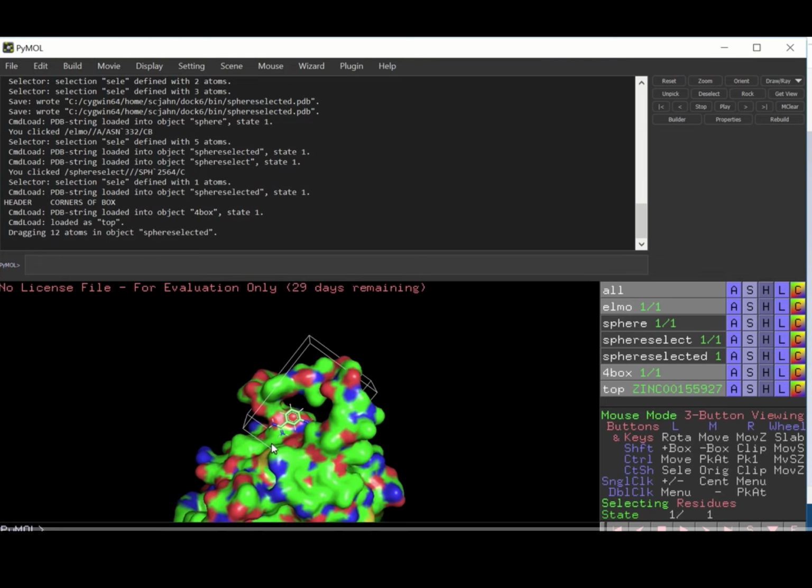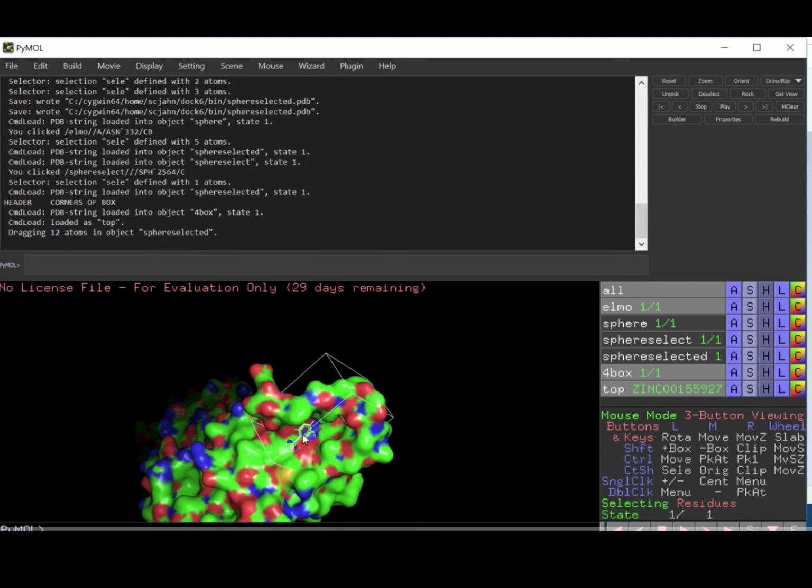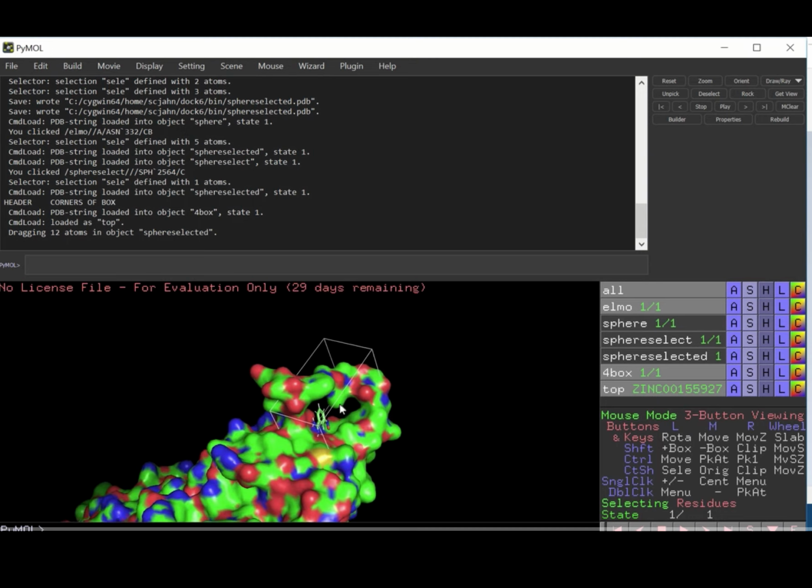And so we have a couple of options if we wanted to make this better. We could either go through and look at the other ones, maybe the next one down is more in our window, or what we could do is we likely had a sphere that was right here kind of on the border. We might be able to delete that sphere, redo the docking, and get this to shift over a little bit further. But that is the end.